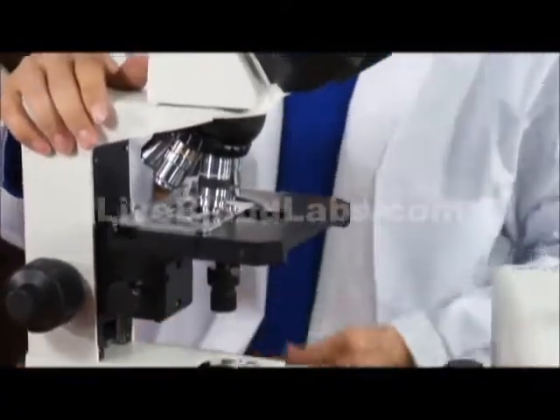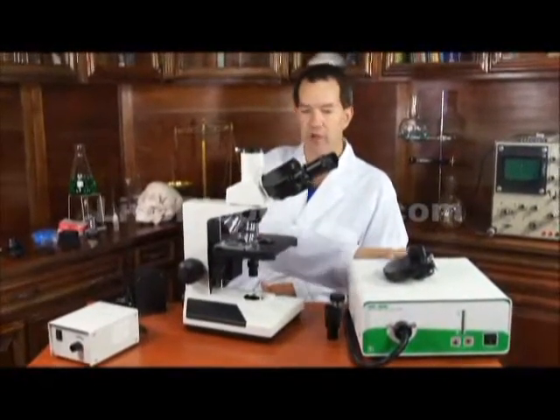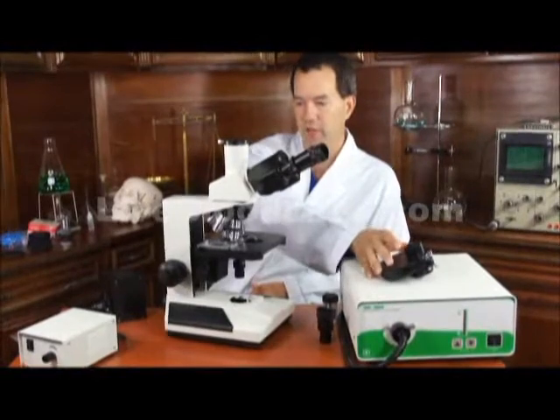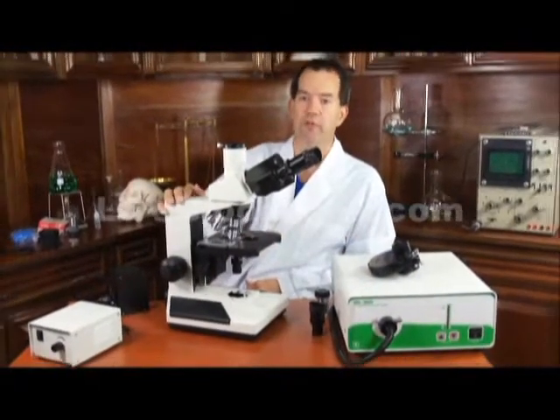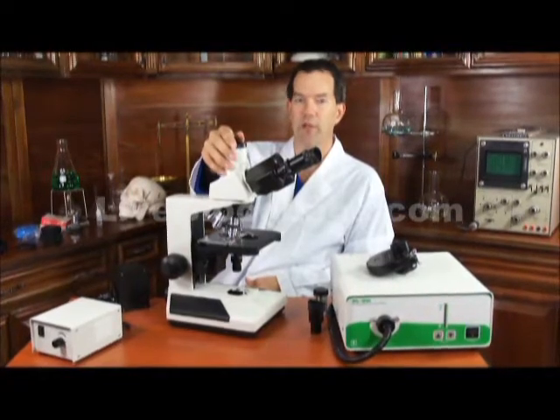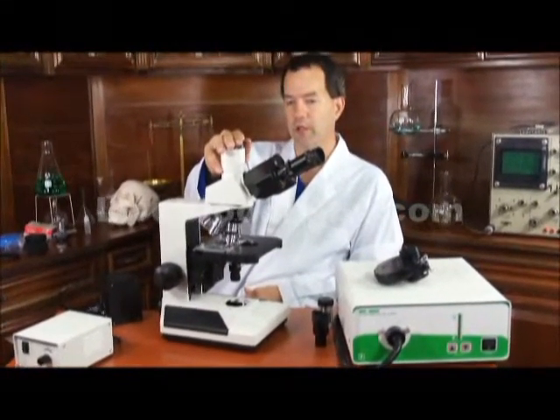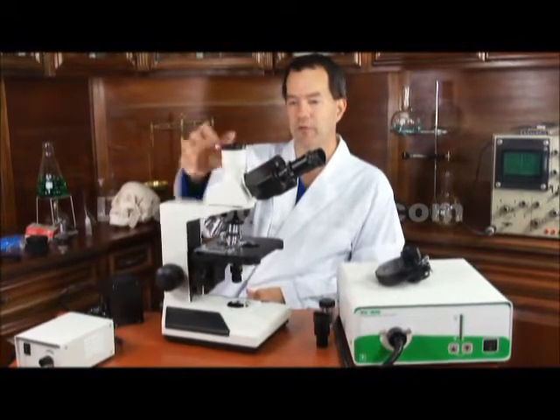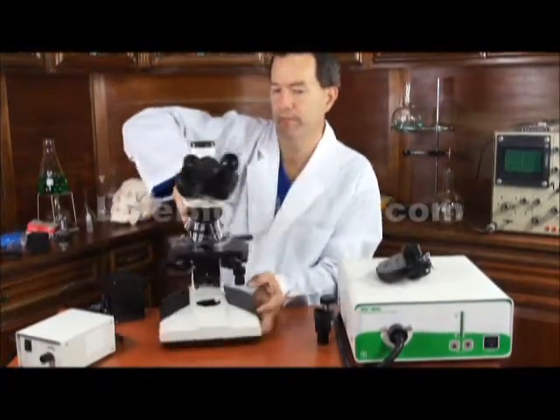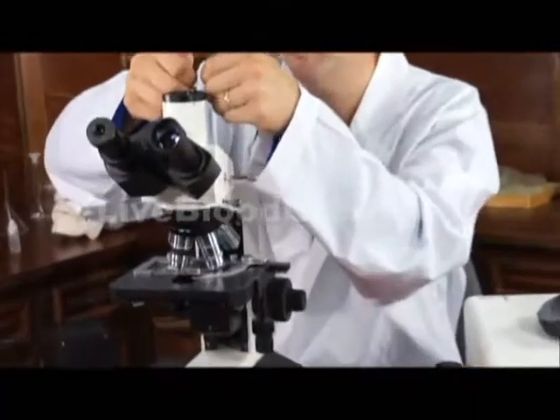Overall, that's the functionality of the microscope. It has capability for dark field, phase contrast, and bright field. It has photography and video capability on top through the trinocular port, with the ability to connect to cameras. It has a trinocular lever — you pull it out to allow the light to go up to the trinoc.